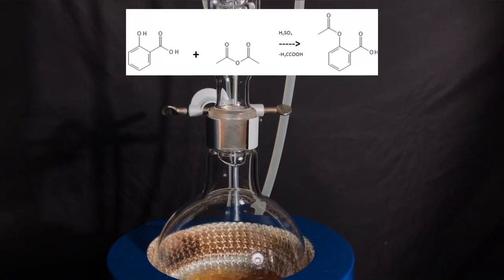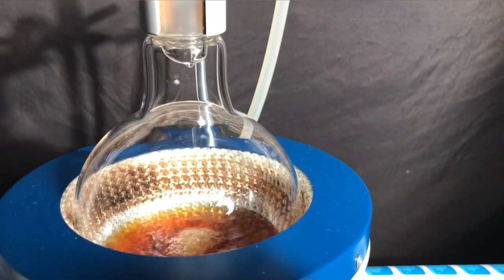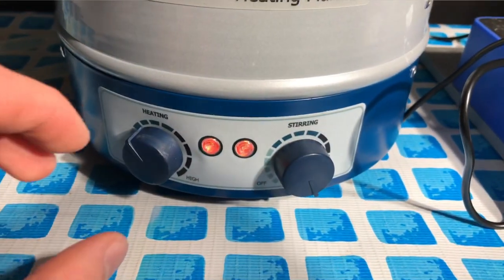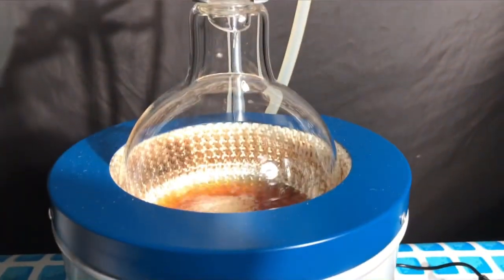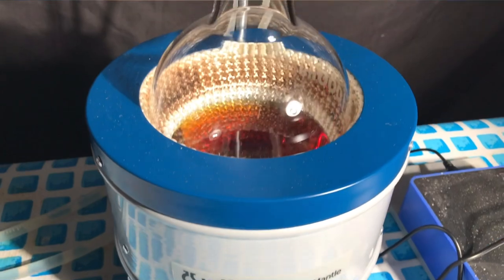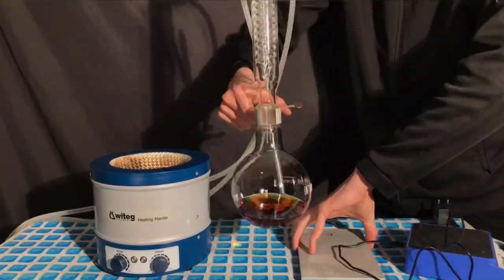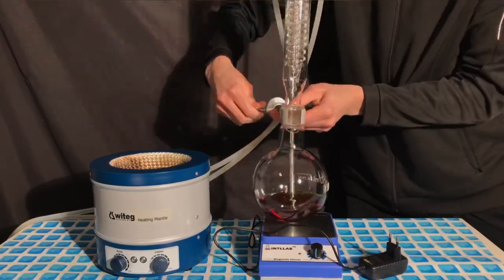If water was present, acetylsalicylic acid would hydrolyze back to salicylic acid under acidic conditions. For this reason, this reaction can't be performed with glacial acetic acid alone — acetyl chloride or acetic anhydride must be used. After 180 minutes of continuous refluxing, the heating mantle was turned off. The apparatus was then disassembled, a magnetic stirrer was set up, and the reflux column was taken off.